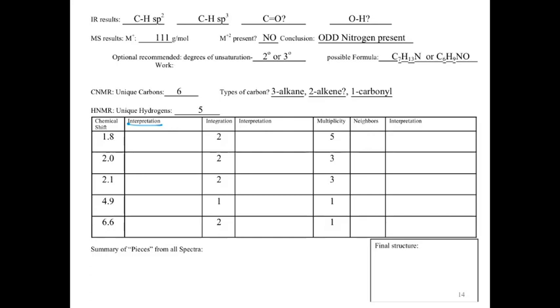But even before you do that, there's a piece of information that's even more important that you could specify. There's hydrogen. Keep it simple. There's a hydrogen present if you've got a chemical shift. Based on that chemical shift range, we're looking at a hydrogen bound to carbon. There is no other information that we can pull out of the chemical shift, so don't try. Again, what we're trying to do is simplify this as much as possible, get it neatly, concisely organized and put together.